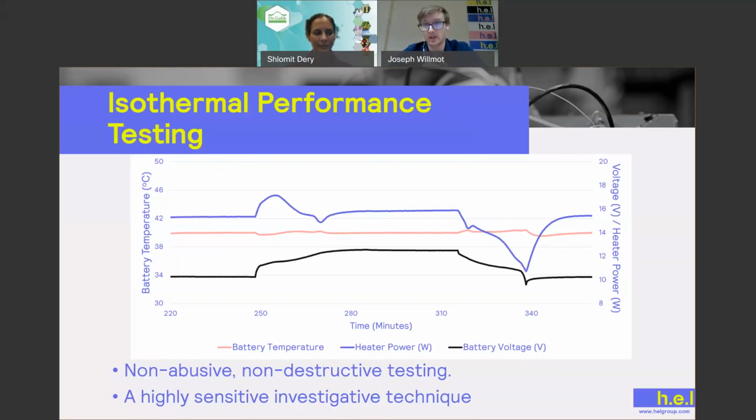We then have a controlling heater that's wrapped around the outside of the cell and undergoes power compensation to maintain the battery's temperature. We have two cooling plates that are above and below the battery, which provide the cooling side of things, and then we use the heater that's wrapped around the battery to input heat and perform the temperature management system of the battery. And this is commonly referred to as power compensation, temperature control.